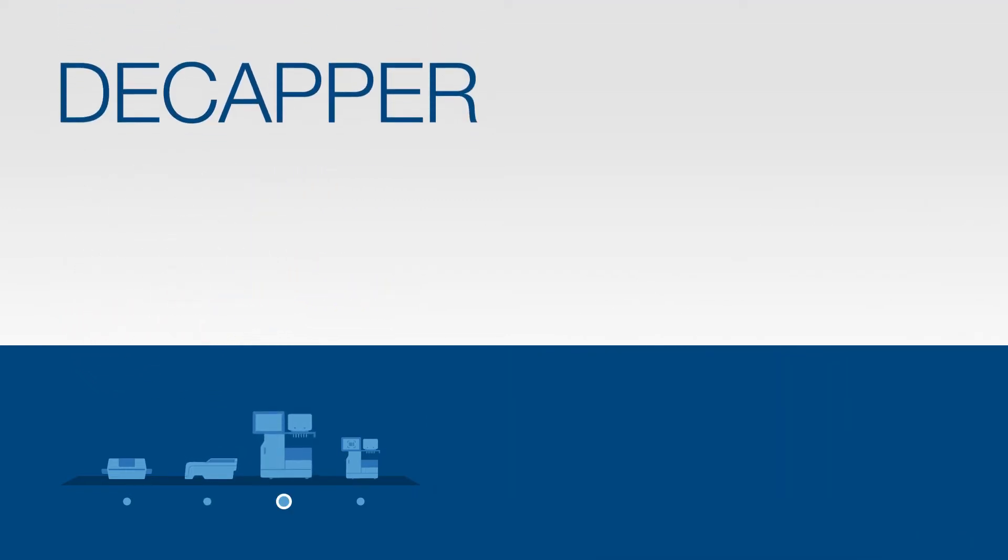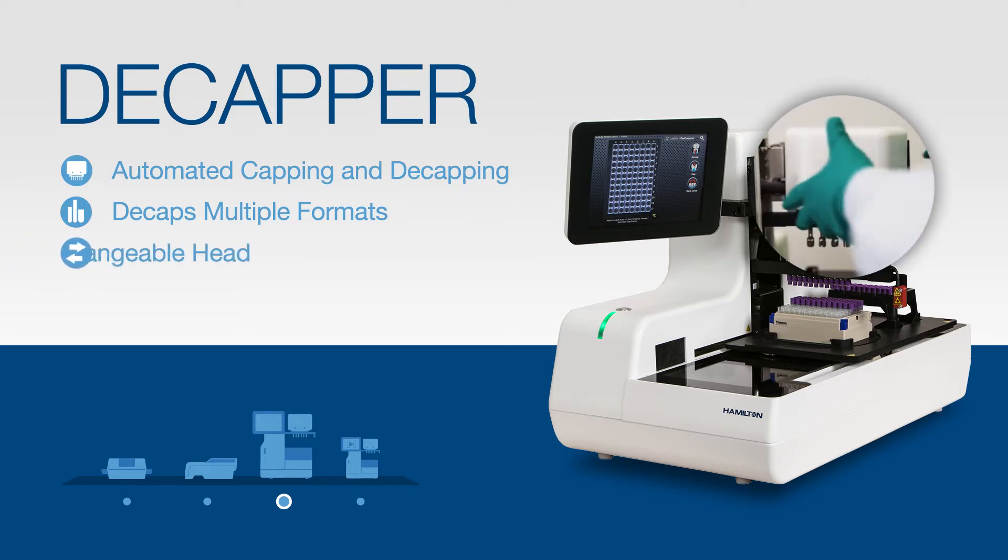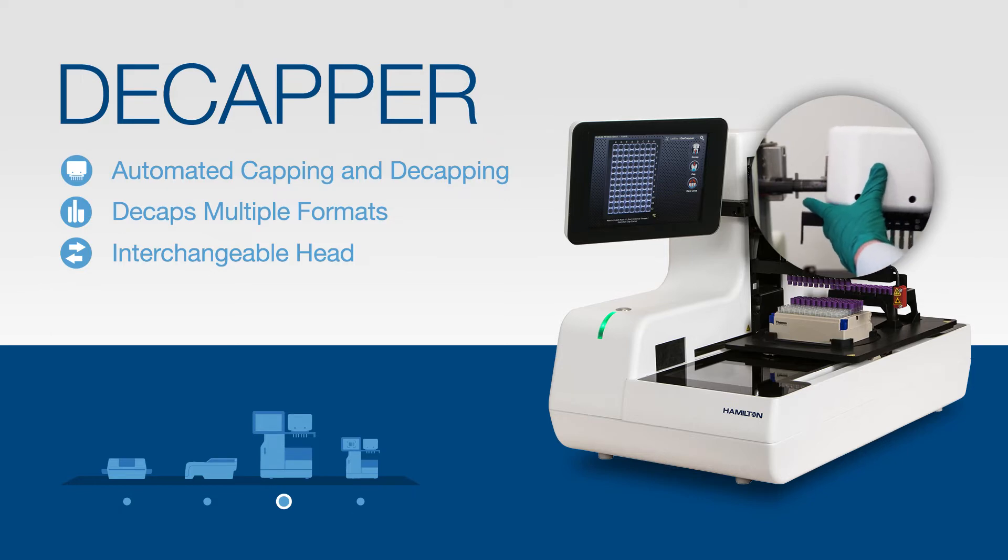Next up is our LabElite Decapper. The Decapper is an easy-to-use device that provides automated capping and decapping of screw cap tubes in 24, 48 and 96 format tube racks with either internal or external threads. The most remarkable feature of the LabElite Decapper is the ability to decap multiple rack formats on one device, simply by swapping out the interchangeable head. We'll explain this more later on, when we demonstrate the Decapper and review all its features and benefits.